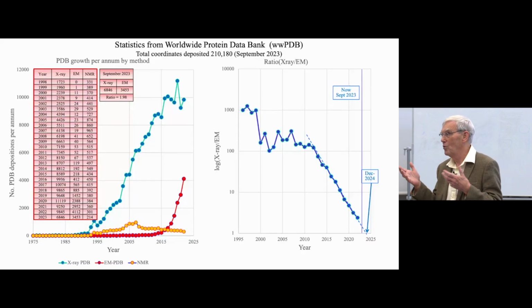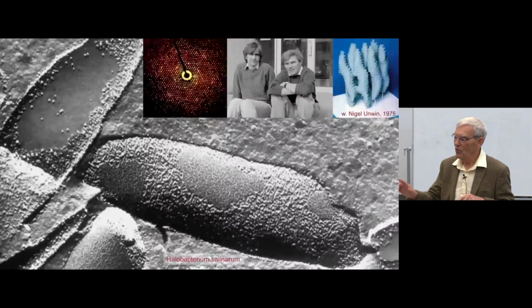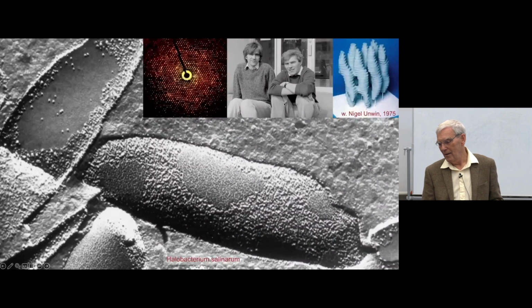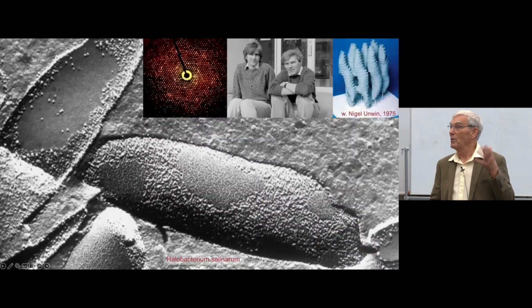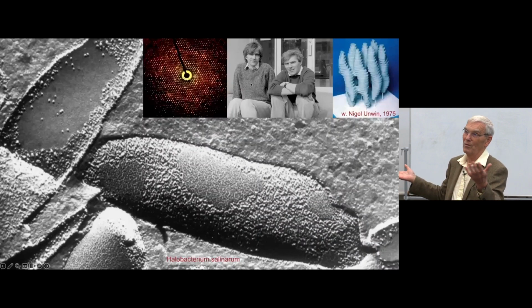And I thought I'd just show you 2 more things. One is, what was it that we did in Cambridge? Well, early on, Nigel Unwin, and Nigel was a New Zealander also, came to Cambridge to do a PhD in metallurgy, but he was recruited to bring his knowledge and skill into biology. And he was giving a talk in 1973. I was supposed to be working on membrane proteins with X-ray. He was doing this on viruses and so on.